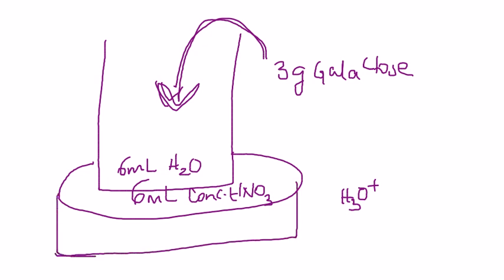Now, once everything is mixed and you have stirred the mixture pretty well, you will set it up on a steam bath. That means you're going to use that metal container. So if I were you, what I would do is, one of you, as you get into the lab, get the steam bath started, because the water does take time to get converted into steam and to get heated up. You have to give it a gentle heat, and the sugar, of course, is going to get into the solution.